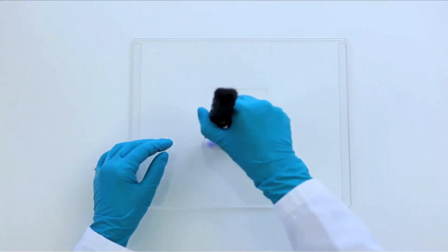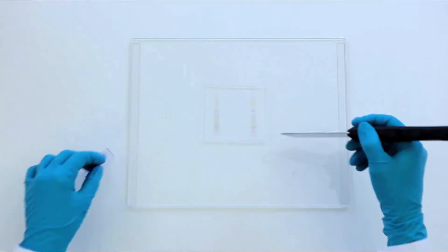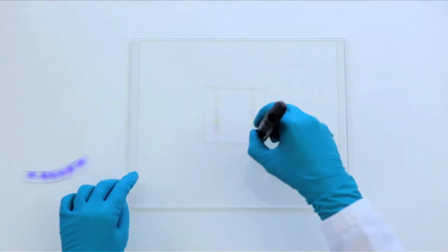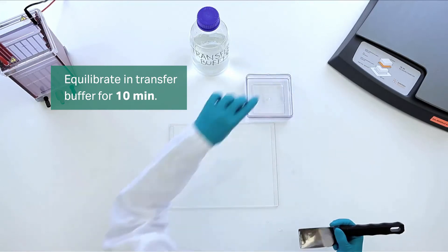First, prepare the gel for blotting by trimming off excess gel. One corner of the gel can be cut off to help with orientation. Then, equilibrate in transfer buffer for 10 minutes to maintain gel shape.